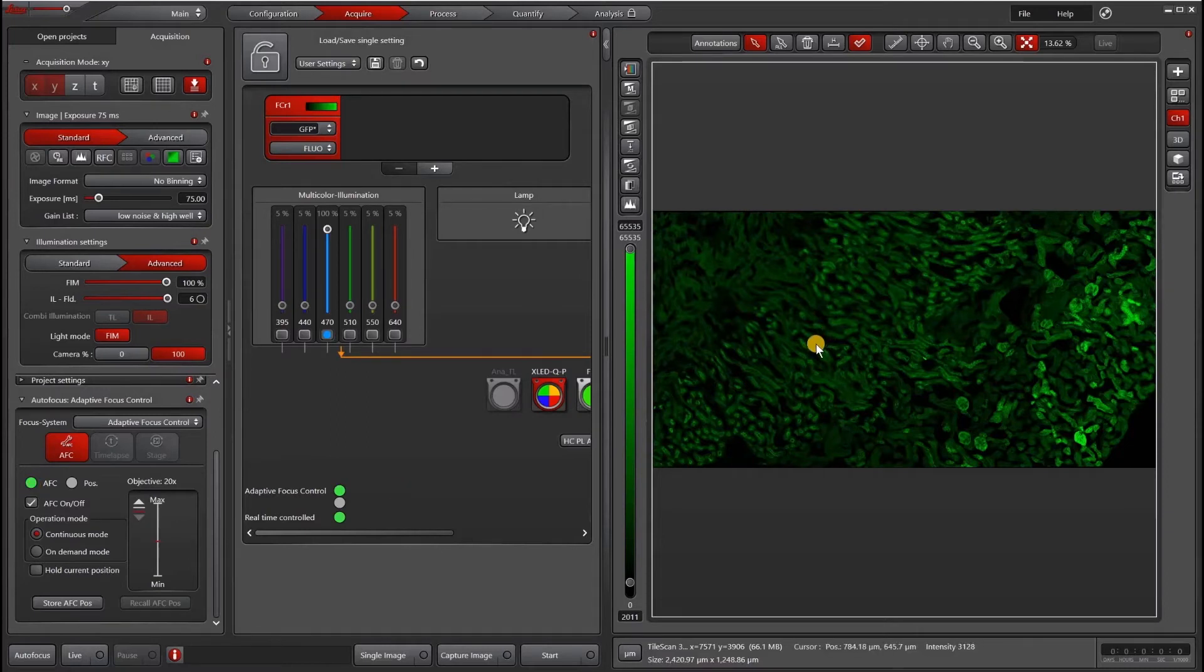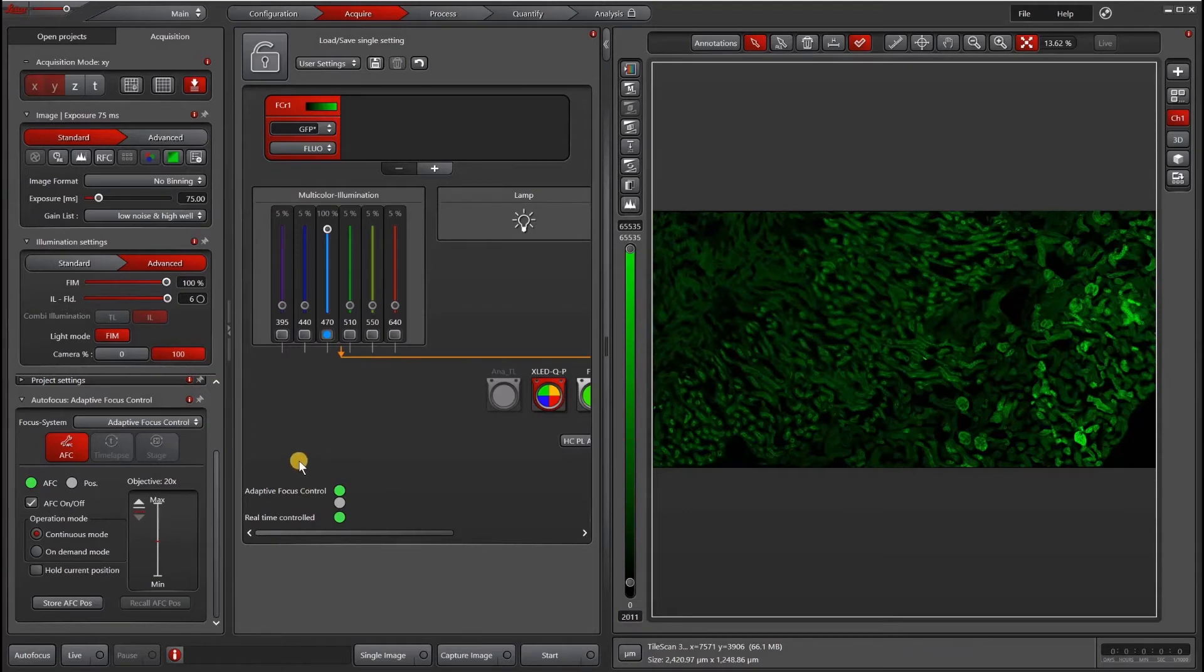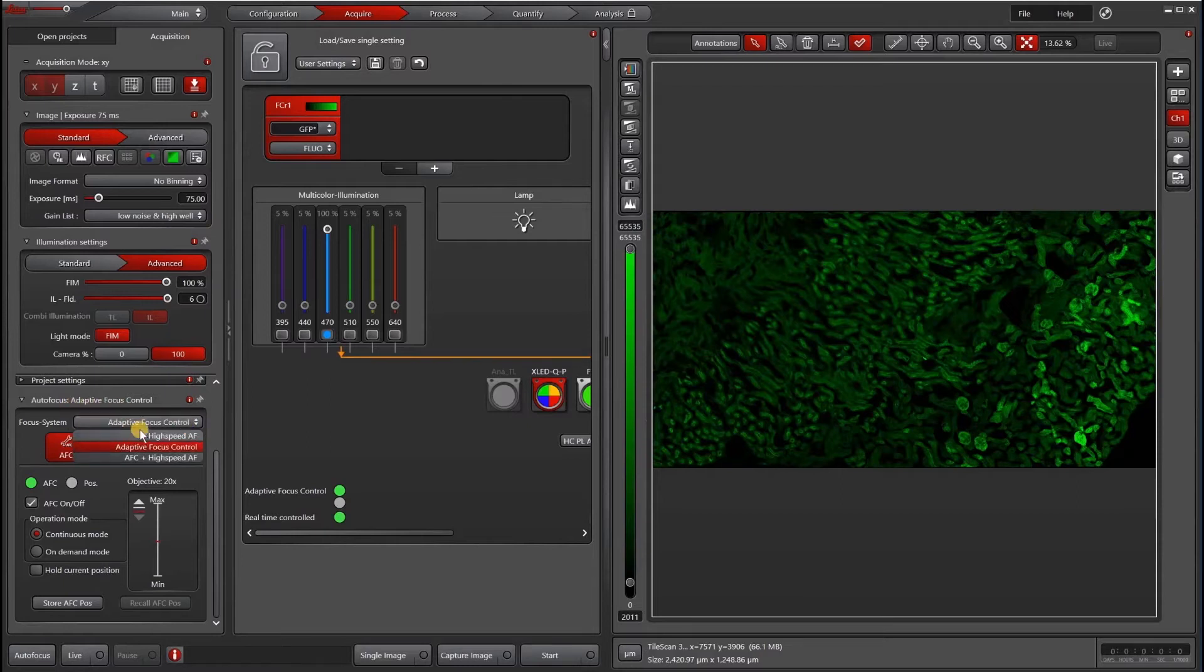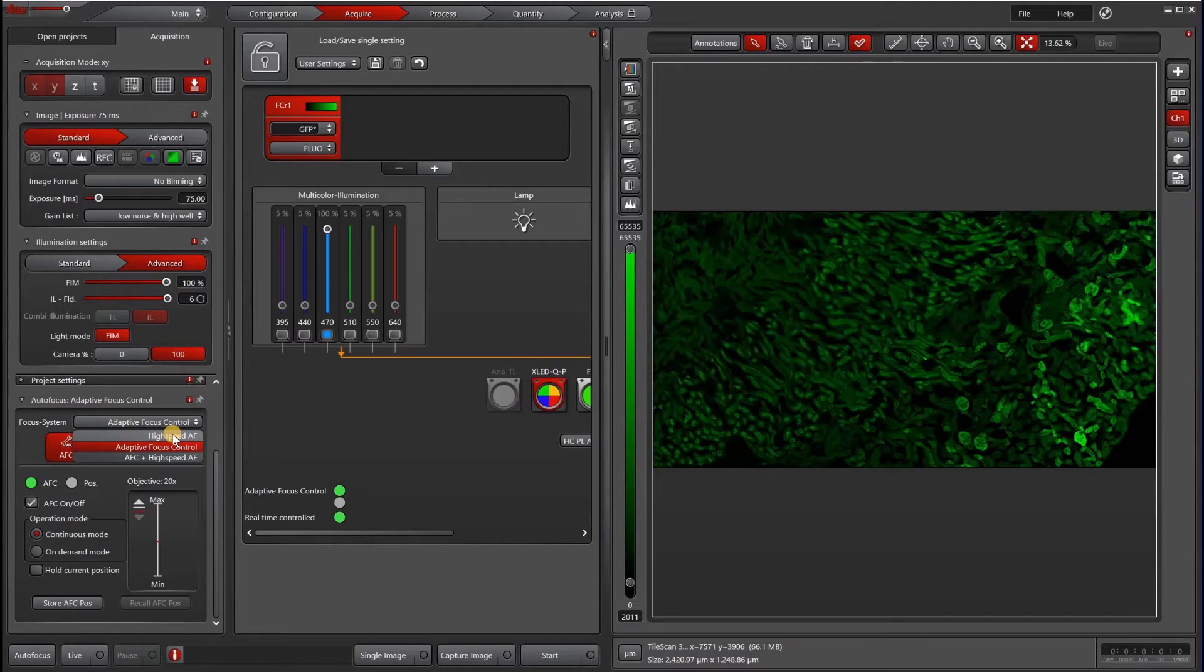Here I am imaging fixed tissue on a slide with a 20x air objective. If you don't have AFC, which you would be able to find under the autofocus panel, then you can always use focus map, which I cover in another video, or high speed autofocus or best focus, depending on whether or not you have synapse.